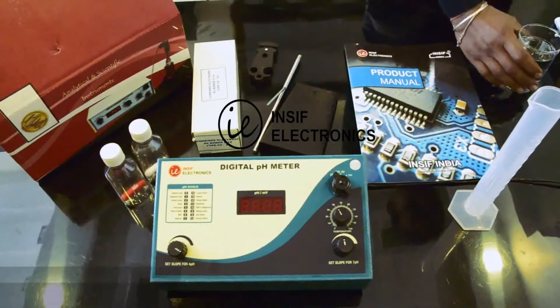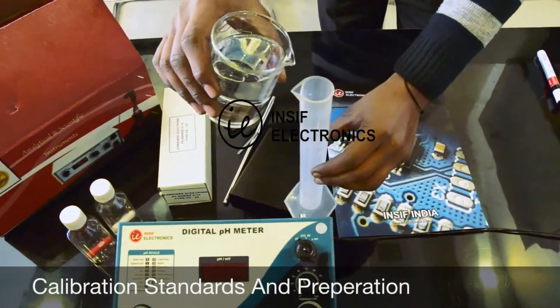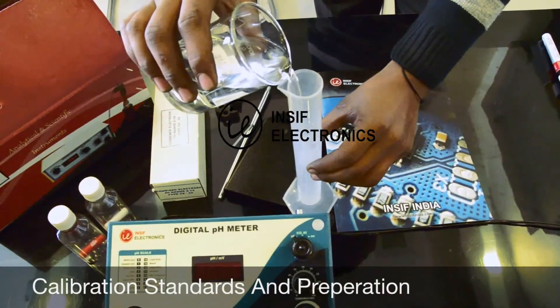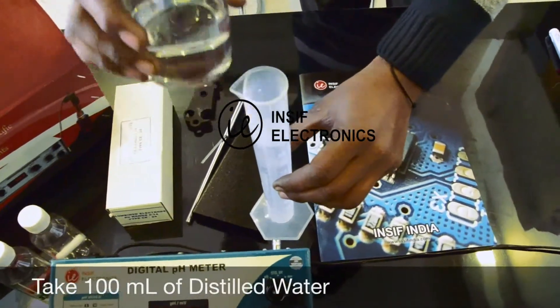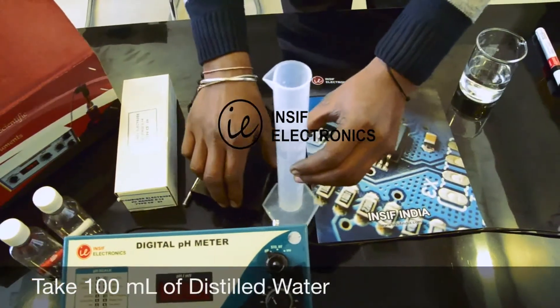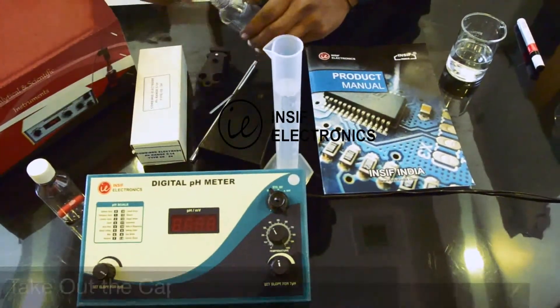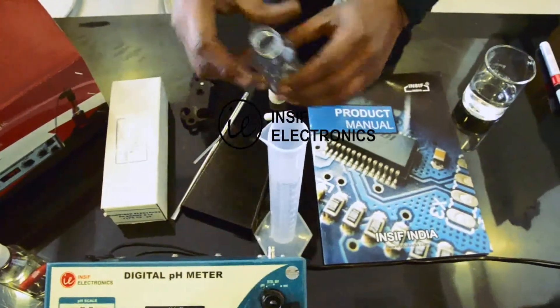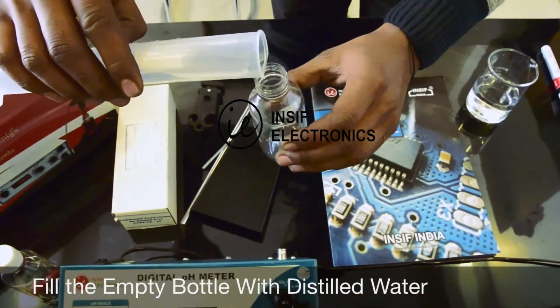Now we are going to prepare calibration standards: pH 7 buffer and pH 4 buffer solution. We are going to measure 100 milliliters of distilled water by using a measuring cylinder. Take out the buffer capsules from the bottles and fill the empty bottle with 100 milliliters of distilled water.